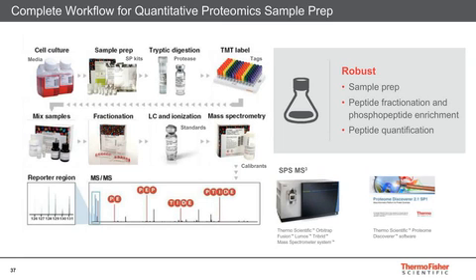Analysis of each high pH acetonitrile elution fraction also shows high numbers of peptide and protein identifications in each fraction. Overall, these results combined represent almost a 2-fold increase in the number of unique peptide and protein identifications seen in the light blue bars compared to those identified in an unfractionated sample in the green bars.